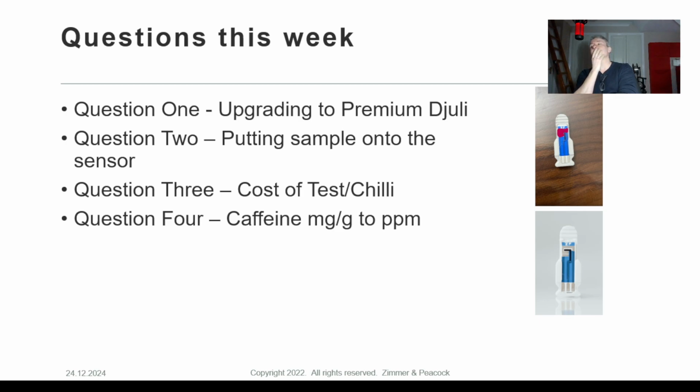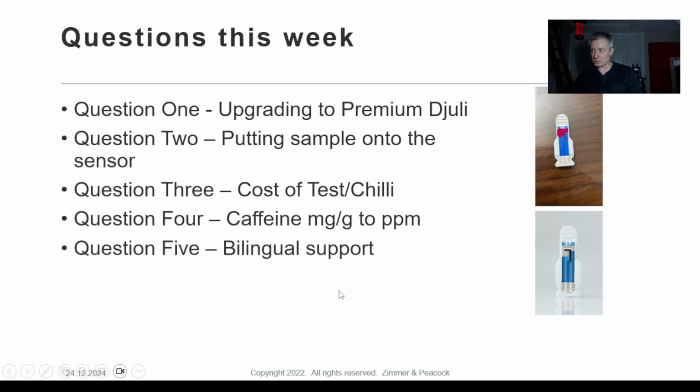But in that particular tea case, the answer that you got was something around 45 milligrams per gram, which suggests 45 milligrams per gram in the original sample. But because you'd actually diluted it before you did the test by another 15x, that was more like 750, which I know is wrong. But if I see the raw signal, I can then take an intelligent approach, I can basically figure it out, let's say, and sort that out.